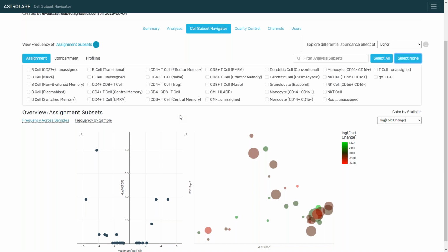You might be familiar with methods such as FlowSOM or SPADE or PhenoGraph that allow you to cluster the data. However, there's always a barrier to entry in using these methods. You need to understand them, you need to pick the right one, you need to choose the parameters, and so on. So Astrolabe eases the burden on that kind of approach as well.